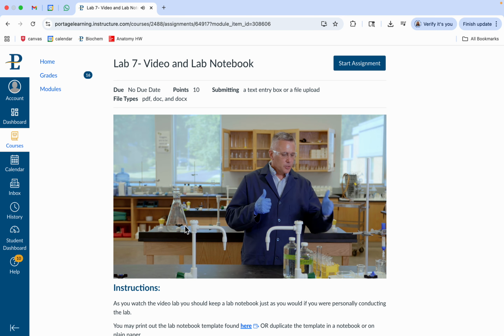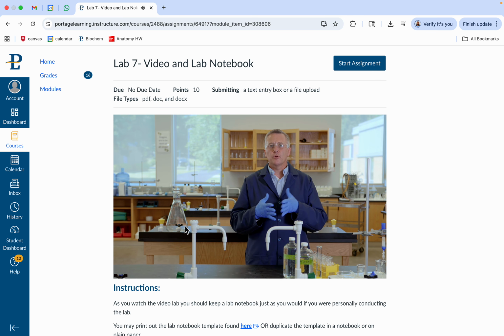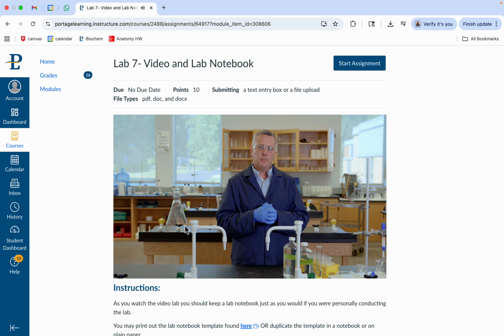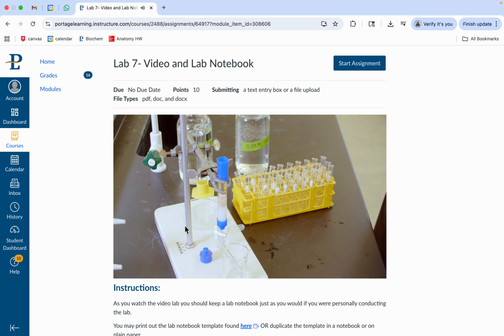A quick GOT activity is just taking undiluted CM fraction. We're going to put it in our cuvette and let it go for 2 minutes. That's a quick one, sort of a quick and dirty method. Say, is GOT present? And we're going to find those results. And then once we find where there's likely the highest concentration of GOT, we'll pull those test tubes and we'll concentrate them and run them on an SDS-PAGE gel. All right, so we're going to let this run. It's going to take a little while. You can see the dripping's pretty slow at this stage, but it looks like the sample's just about all into the gel, just a little bit more to go.